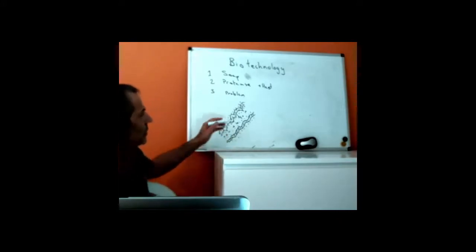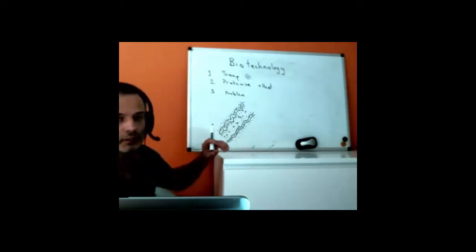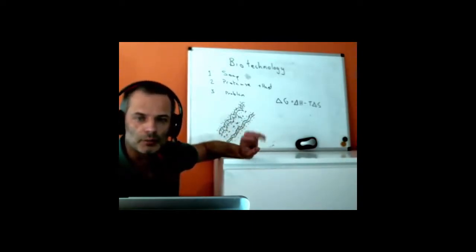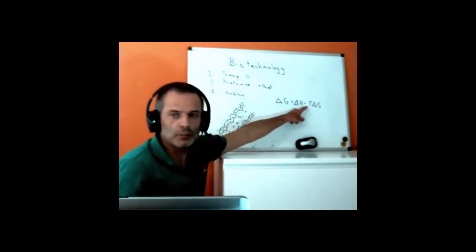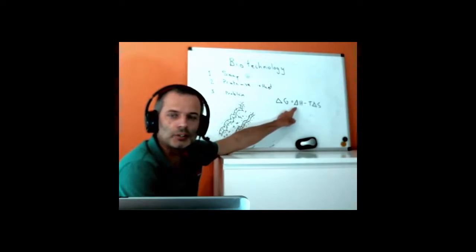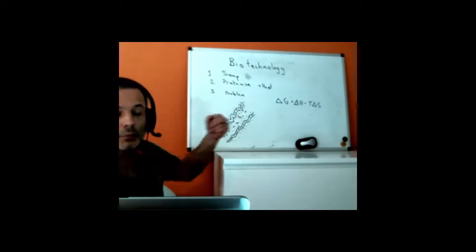Then what we're going to do is we're going to convert this water into a less polar solvent, and we're going to make it unhappy by cooling it down. So this is the Gibbs free energy equation from physical chemistry, but it tells us what we need to know about this process. So if we have a process where generating a solid is going to make it more ordered, then we will need to reduce the temperature to make that process more likely. Assuming we will also have to set it up so that we get some energy out from this, and that is caused by the different components interacting with each other, so these positive and negative ions interacting with each other, and the water and whatever we're going to add to make the water less polar.